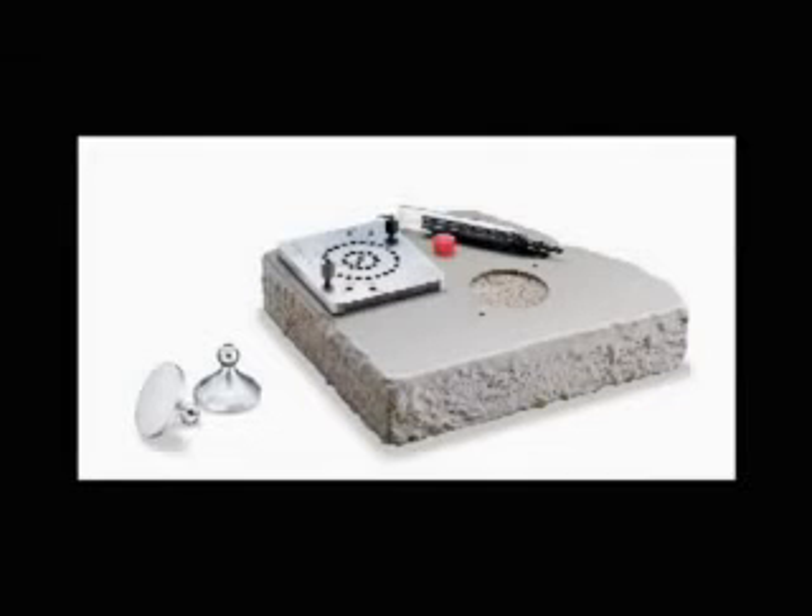For testing thick coatings with a 50 mm dolly, an optional drilling template may be preferred to a cutting tool. The final step is the performance of the pull-off test.